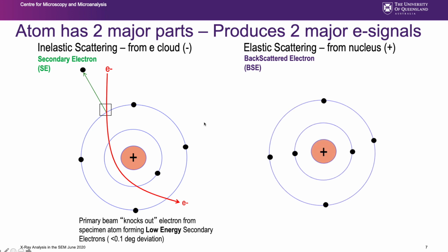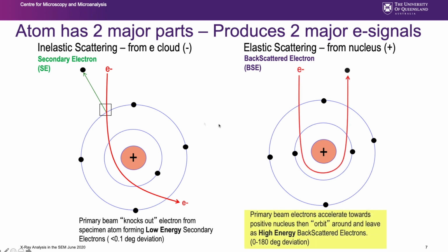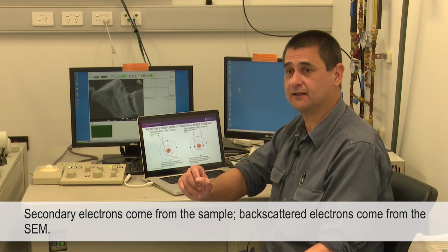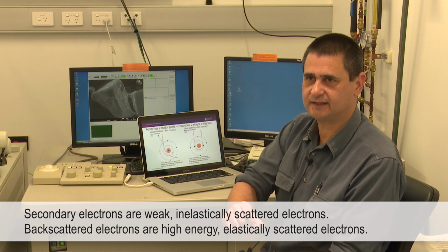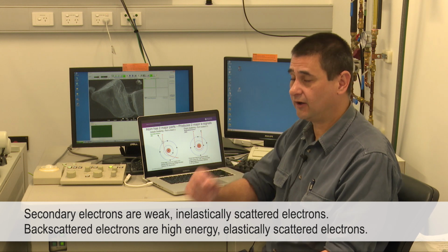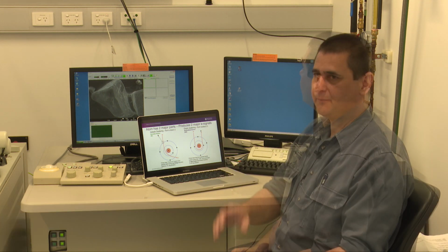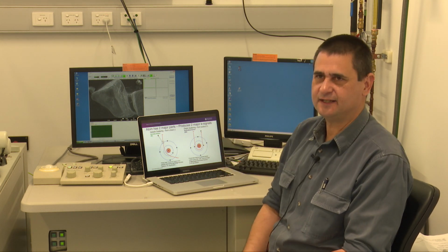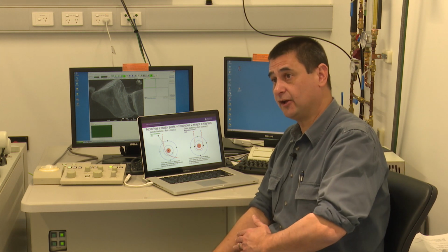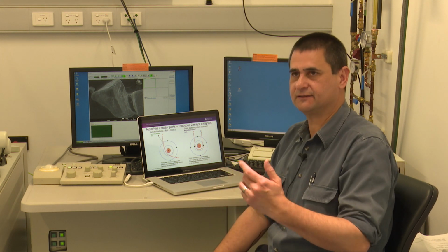Now, if we consider again an atom, you've got electrons around it, a positive core. The primary beam electron from the SEM is attracted to the atomic nucleus. It does an orbit round it, and then it goes back out. Secondary electrons are from the specimen, backscatter electrons are from the SEM. Secondary electrons are weak, inelastically scattered electrons. Backscattered electrons are high energy, elastically scattered electrons. A backscattered electron can go anywhere from 0 to 180 degrees. 180 is quite rare, but again, it can go through much higher angular deviations than a secondary electron.